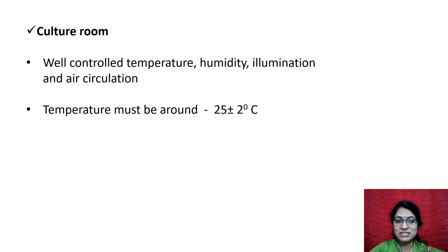When the fan is connected to electricity, the sterilized air that comes from the fan enters the pipe, and each and every plant tissue culture tube will get a uniform distribution of air. So that facility must be there in the culture room.